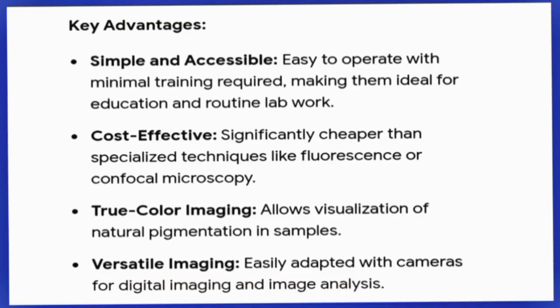Advantages: bright field microscopes are easy to operate with minimal training, making them ideal for education and routine lab work. They are significantly cheaper than fluorescence or confocal microscopes. This technique allows visualization of natural pigmentation in samples and is easily adapted with cameras for digital imaging and image analysis.